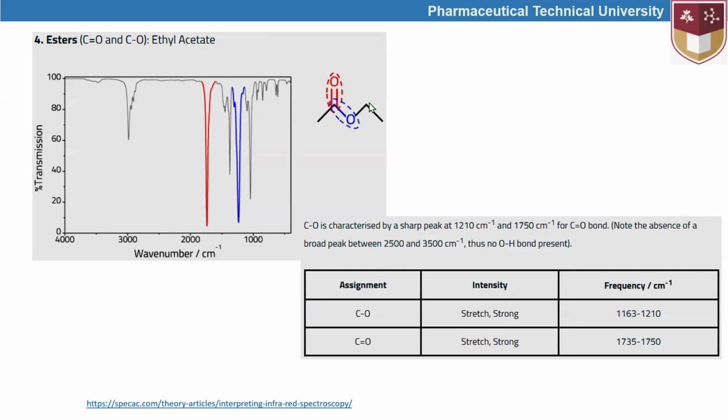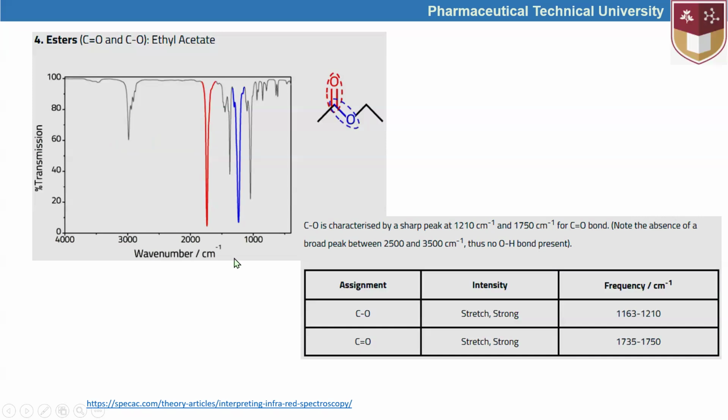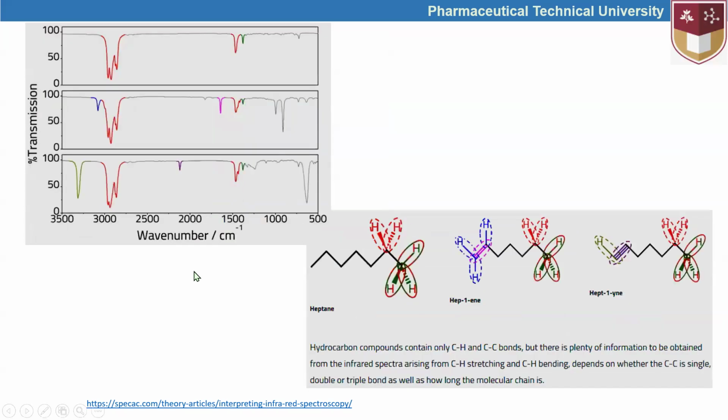So the addition of the ethyl group to the oxygen, the exchange of hydrogen with the ethyl group, is causing the disappearance of the band belonging to the oxygen-hydrogen interactions as indicated here, and the carbonyl group and the carbon-oxygen single bond absorptions are kept in the next examples as well, as indicated here. Okay, so by providing this kind of comparison, we can make claims about the presence and quantification of some functional groups in the compared samples.